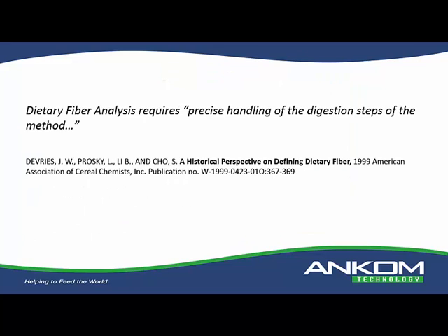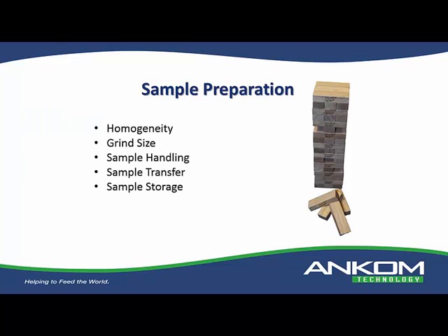The method itself — the two key developers state that the analysis requires precise handling of the digestion steps, so shortcuts or unvalidated modifications will impact results. Sample preparation may seem rudimentary, but it can have a significant effect. The homogeneity of the sample, the grind size — the method calls out a specific grind size — but often laboratories grind everything the same way or receive samples already ground without knowing if they meet method specifications. How samples are handled, the transfer from weigh boats to beakers, filtration, and sample storage all can impact results.